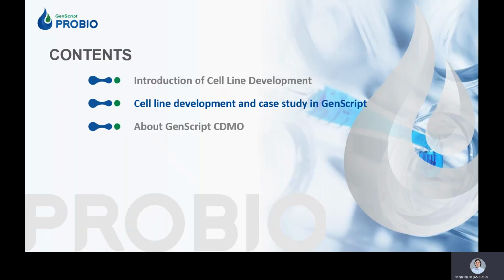The above is an introduction to the 3 starting technologies involved in cell line development. Next is the introduction of the cell line development platform of GenScript ProBio, including the workflow, process control and the case studies.